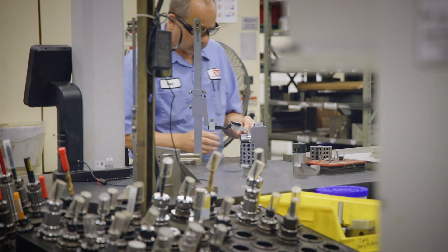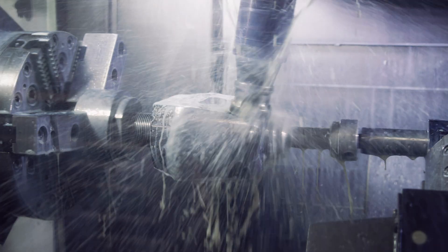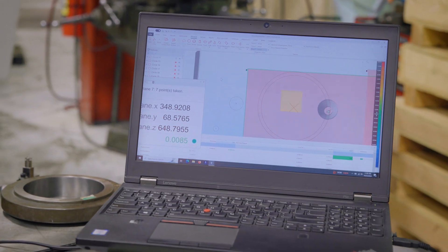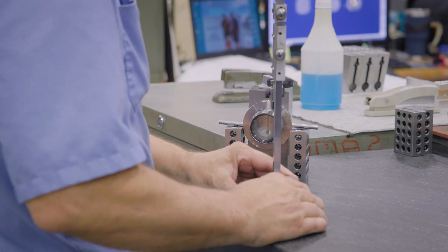Every part is machined to exacting tolerances for precise axial alignment of the frame and load string components. These parts then undergo rigorous checks with state-of-the-art inspection equipment to verify they meet our stringent precision requirements.